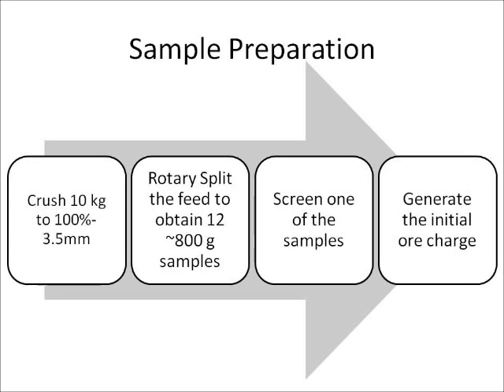Maxson explained that in parallel grinding of two ores with different densities, the volumes of the ore are more similar than the mass of ore contained in industrial mills. Furthermore, the Bond ball mill with a 700 cc charge only occupies about 35% of the voids. This volume is practical for testing as grinding occurs quickly. Note that this test is not run at conditions that ensure maximum efficiency, because that is not the objective of the test.